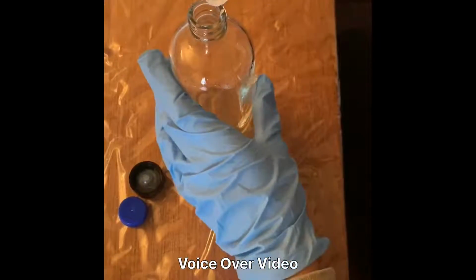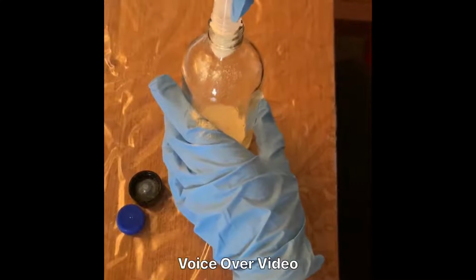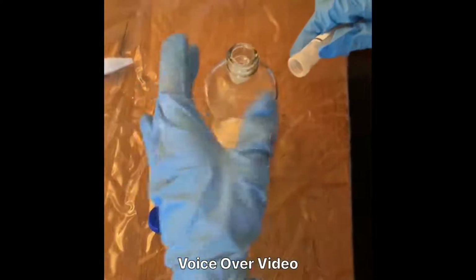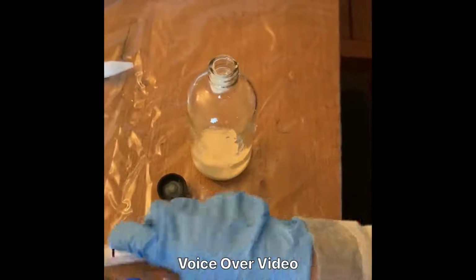I'm taking the agar, the LB amp one, and pouring it into the glass bottle. Then I'm going to take some water and pour it in and put it into the microwave. And just toss these to the side.